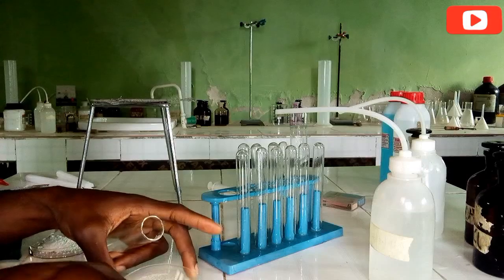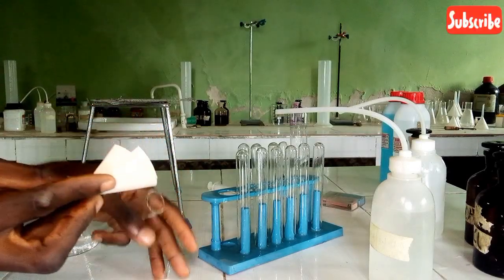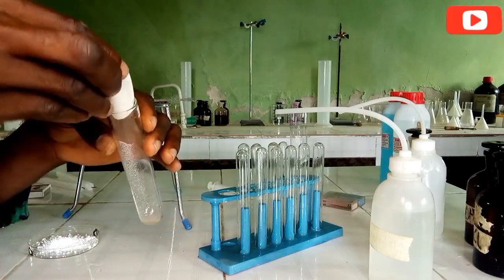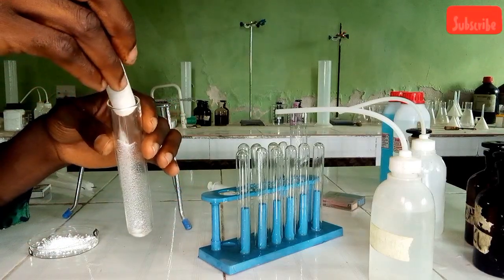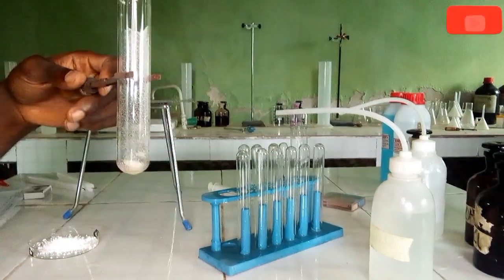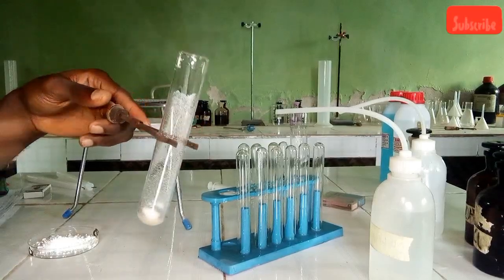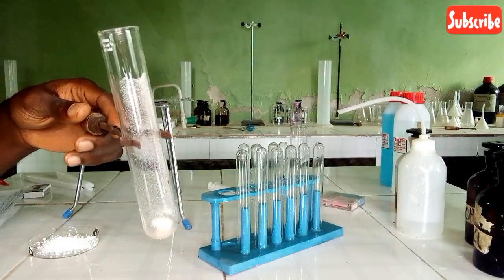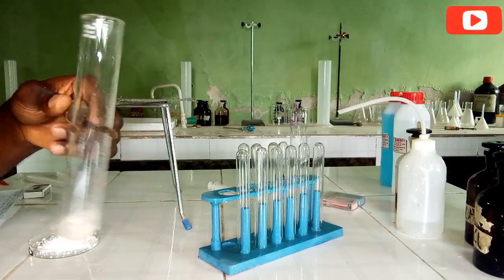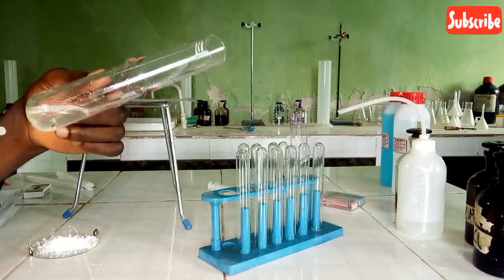So let's do that now. In the absence of a spatula, I use this to take the sample and add it into the test tube. I will need a test tube holder. Let me hold it. So I have added it into the test tube and I'm holding the test tube right away. Let us add a few centimeter cube of water, which is enough to dissolve it. So let's see the response.